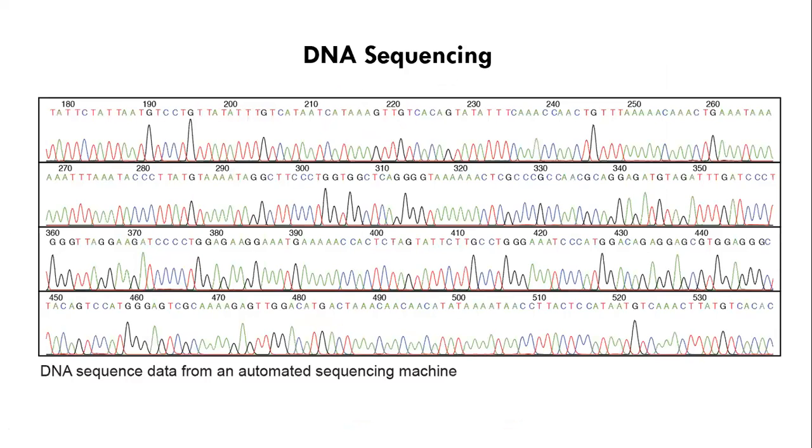So just a glance, in the next 10-15 minutes we will understand advances in genome sequencing methodologies. This is a stretch of DNA sequence that came automatically from a machine, not running through PCR, running through an agarose gel, staining, and then understanding the size and which are the bands. You don't need to do that.